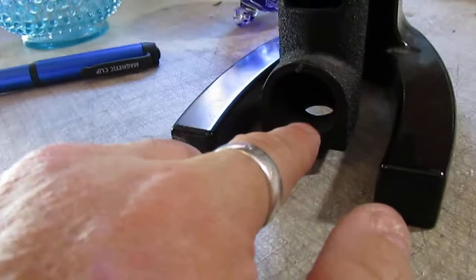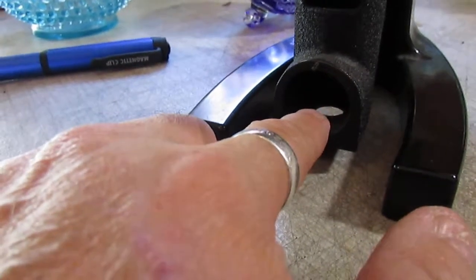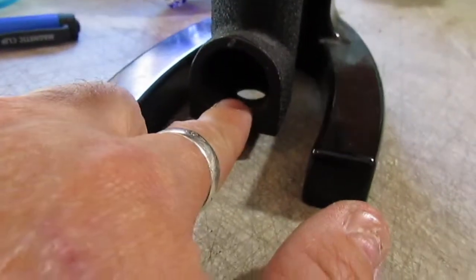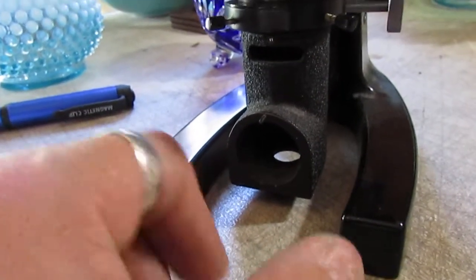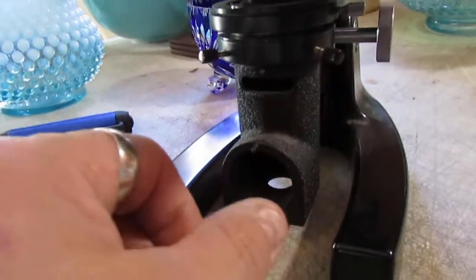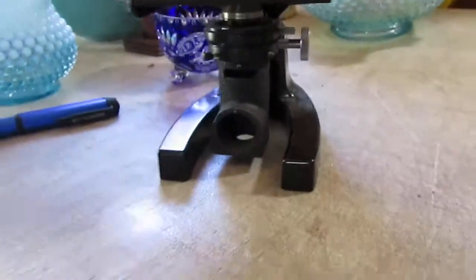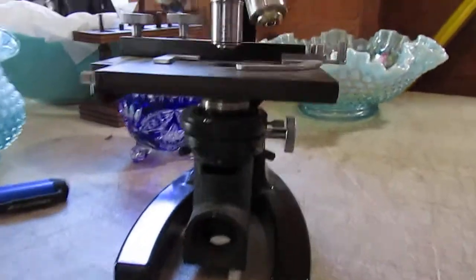Honestly, I believe this is where a light source would be mounted. But I am not 100% sure about that. We don't know much about microscopes in particular.